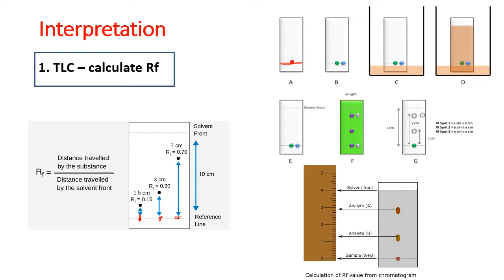And then I will place this TLC sheet in a mobile phase that runs all over the silica sheet, and that will separate the components of the samples that you added according to the analytes found inside. So for example, if I have 2 analytes in this spot, then after passing your mobile phase, you will get 2 separated spots, A and B.